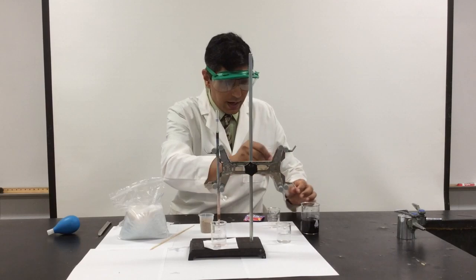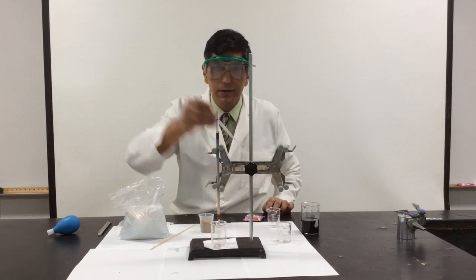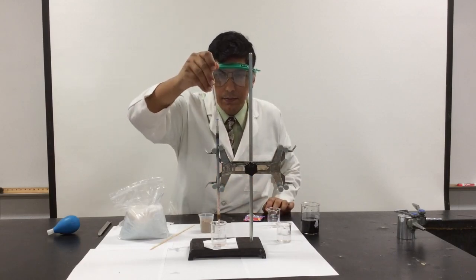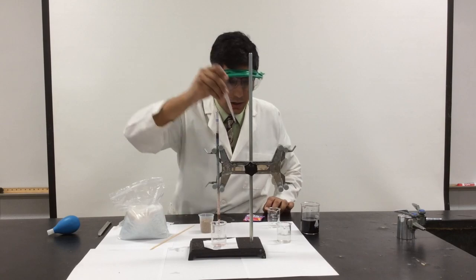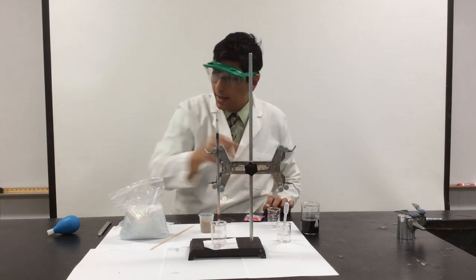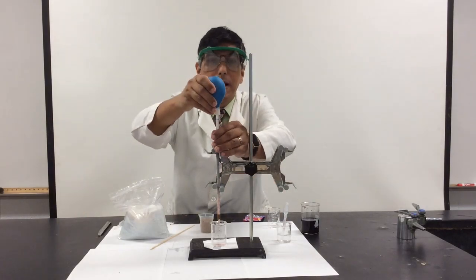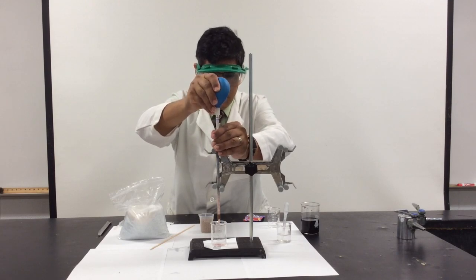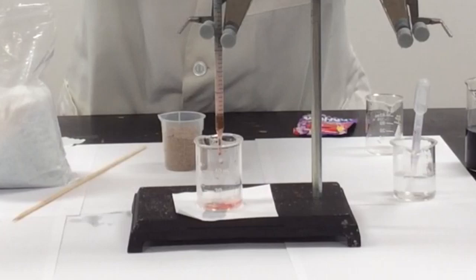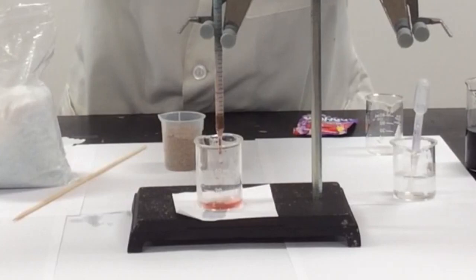To continue the separation, I'm going to add some more distilled water to the top of the column. And I'm going to continue to push that through with the pipette bulb. And as you can see at the bottom of the column, we start to see the red dye falling through into the beaker.